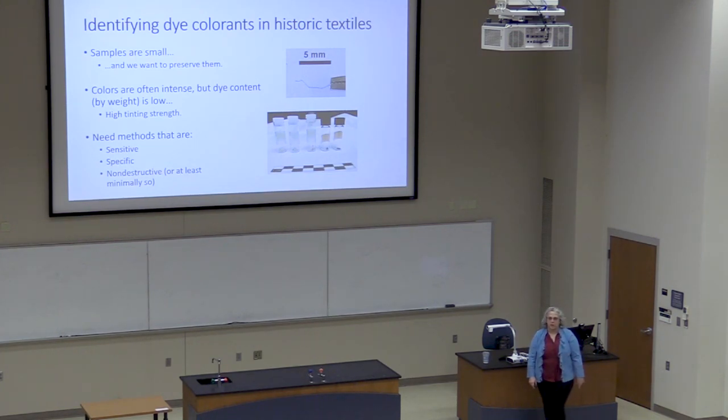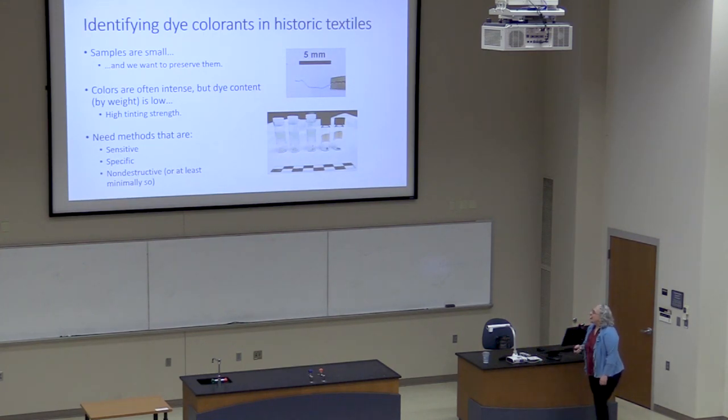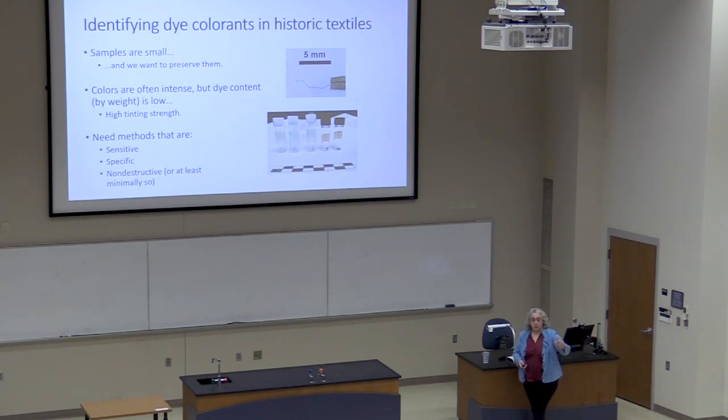Although if they give us one fiber, they're probably okay. Very first time we tried this, it was very nerve-wracking because we were trying to run the sample and it went and sucked into the mass spectrometer and was gone forever. We just sit there going, oops, that wasn't good. We got better at holding our samples after that. Much more careful. Now, as I said with the cochineal, one bug, get a lot of color from that. So what we call that is a high tinting strength. So not a lot of molecules to get a lot of color. Okay, so that means that there's not going to be a lot of molecules there for us to detect, even though we can see it and see that there's lots of color.